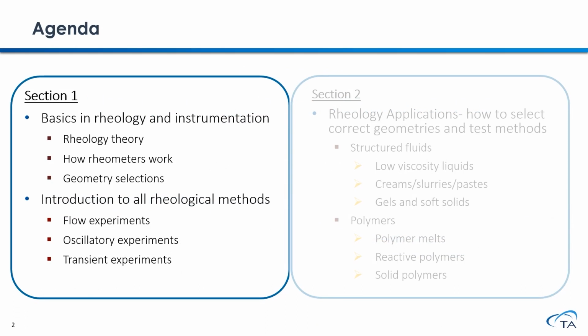Here is the agenda for what we'll be covering today. First of all, we'd like to introduce the basic theory of rheology, and then we're going to talk about what a rheometer does, how we use a rheometer to perform rheological measurements, and how to select the appropriate measuring geometry.